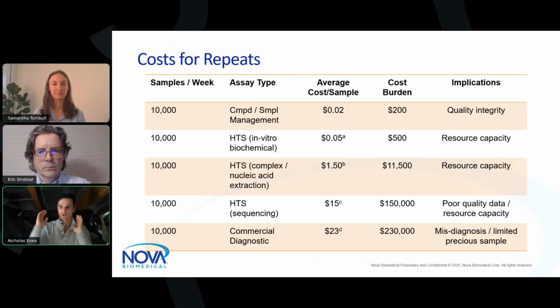One, Hamilton did a great job at saying how to optimize liquid classes. I kind of walk through globally why you do it as well. But ultimately, it comes down to costs, right? Liquid handlers are not cheap to run. The reagents, dependent on assay types, are not cheap to run as well.